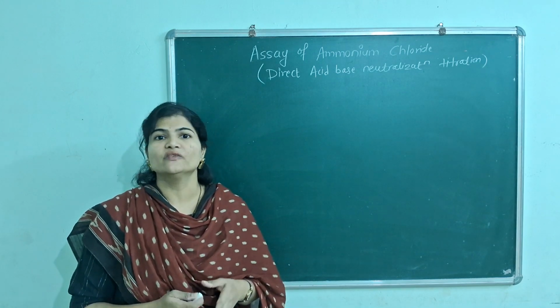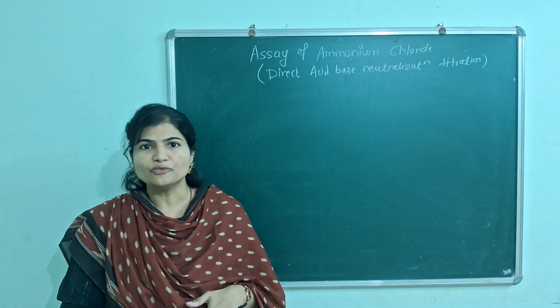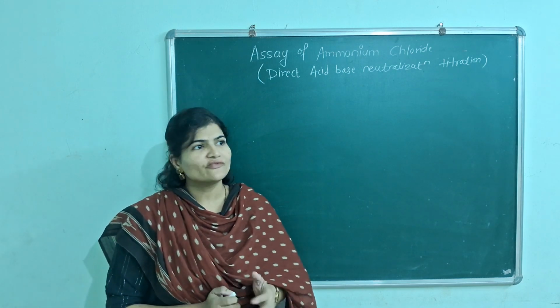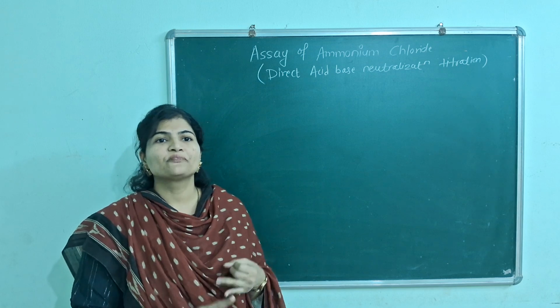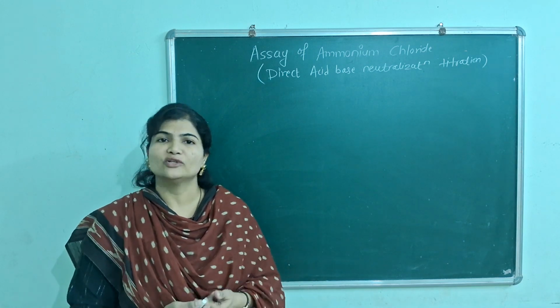In today's video, we are going to discuss assay of ammonium chloride by direct method using aqueous acid-base neutralization titration. So we'll try to cover everything. We'll look at principle, reaction, the procedure, important points and calculations also.